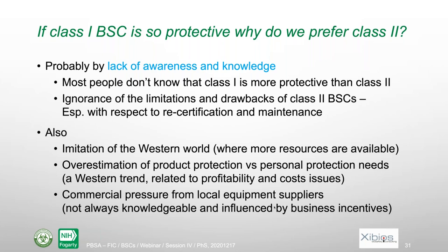I think that also there is some sense of imitation of what is done in the Western world. Of course, we have very good labs and so on. We have nice equipment, but also more resources are available. And so you cannot just copy something if you don't have the same resource behind. In some cases, it's possible. In some other cases, it's not. Also, in the West, there is a trend to overestimate the need for product protection versus personal protection. I mean, both are important, but we pay a lot of attention to product protection. And that's related to the way the West is working. It's based on profitability, cost issues, including the cost of losing one experiment or the cost of manpower and so on. So the situation is different in Pakistan.